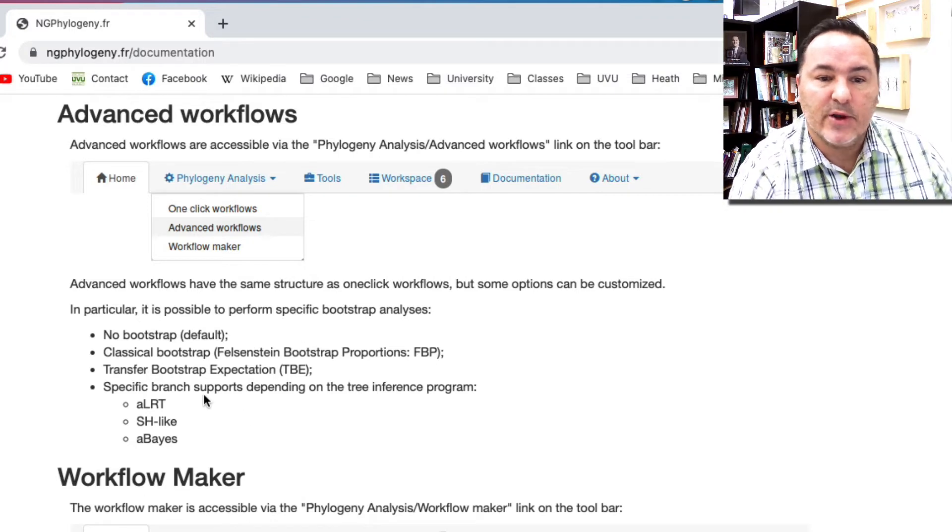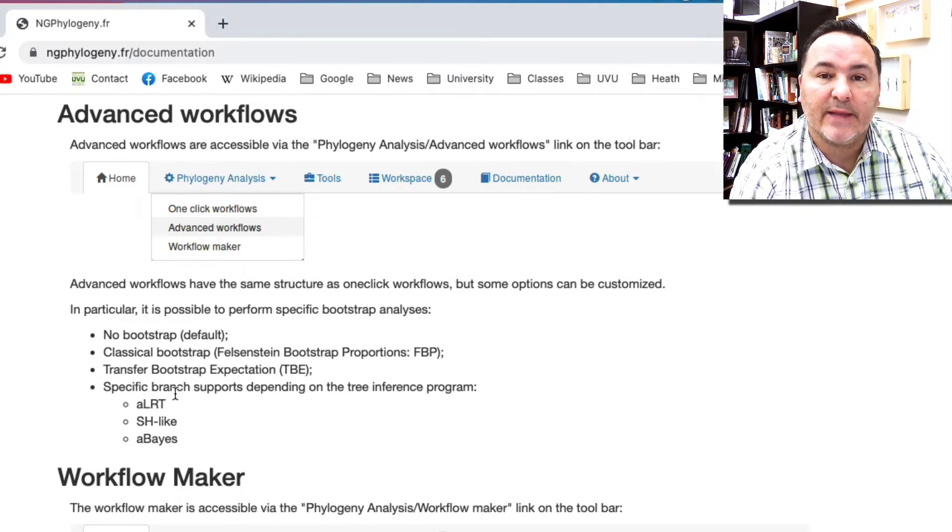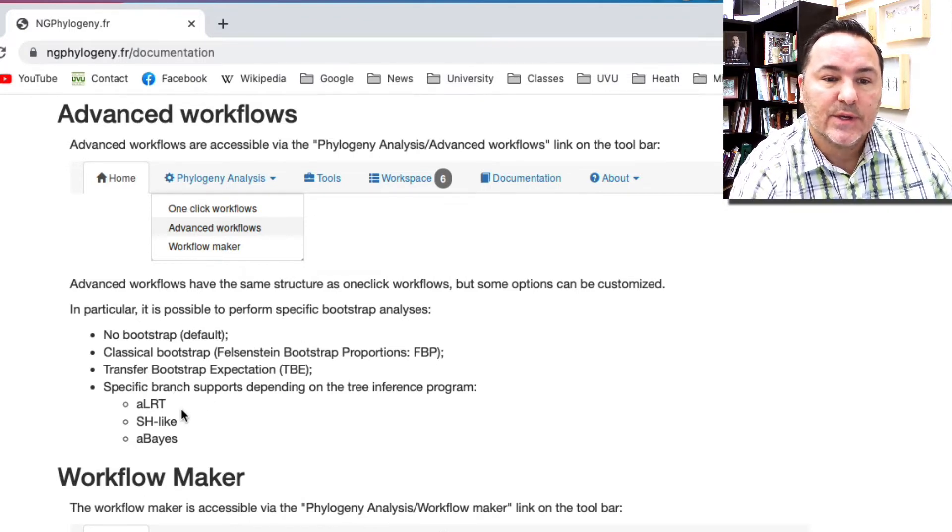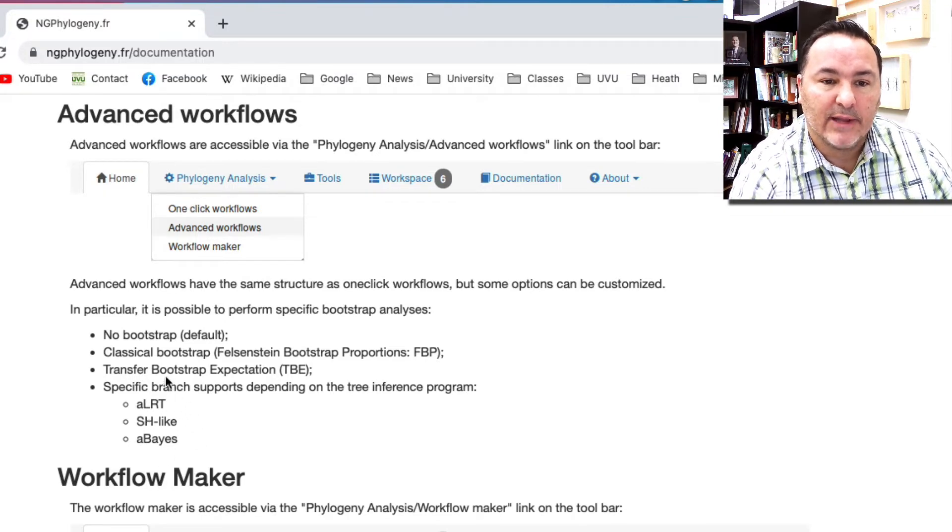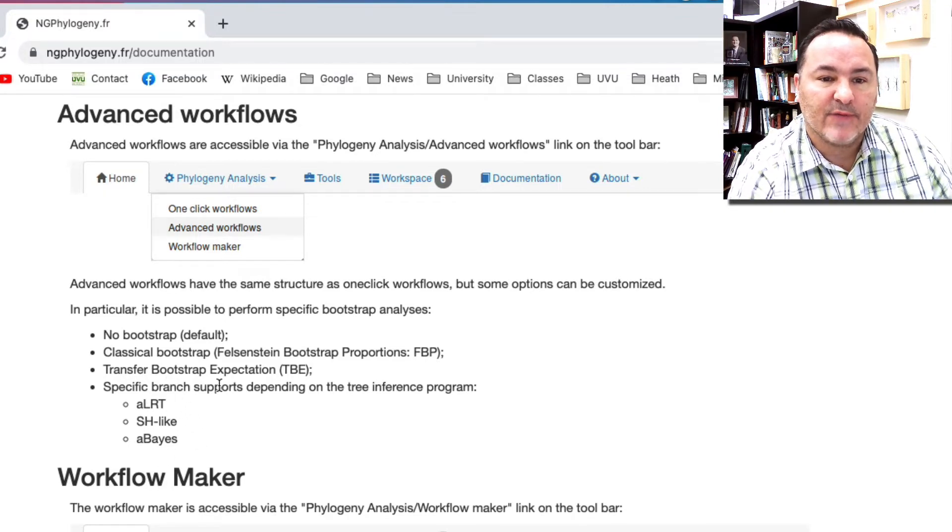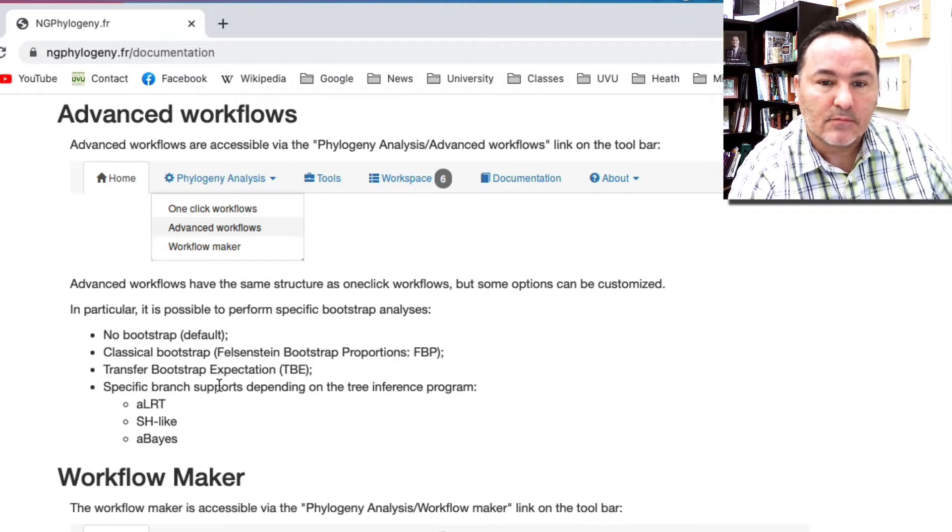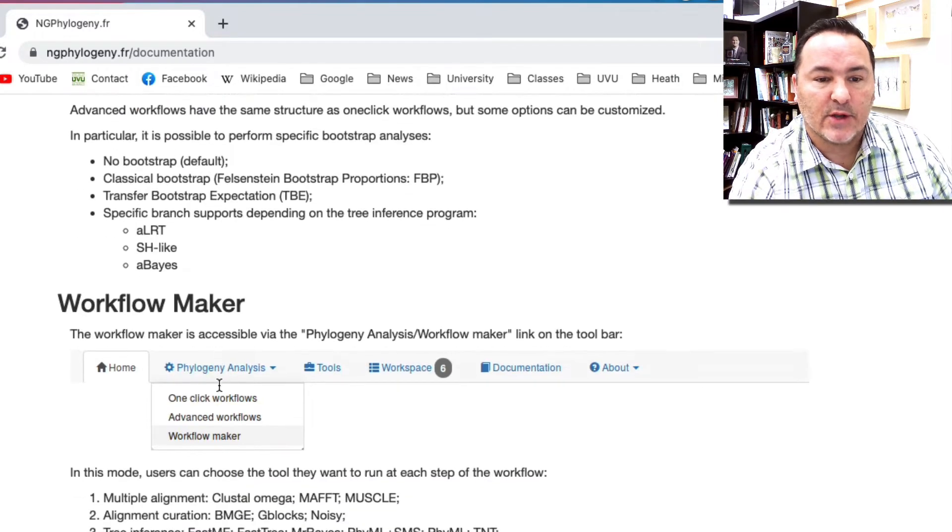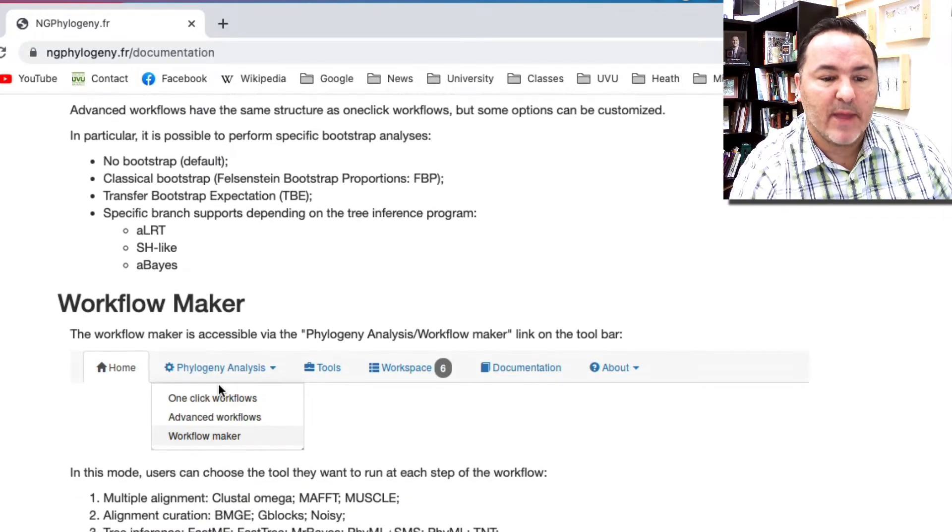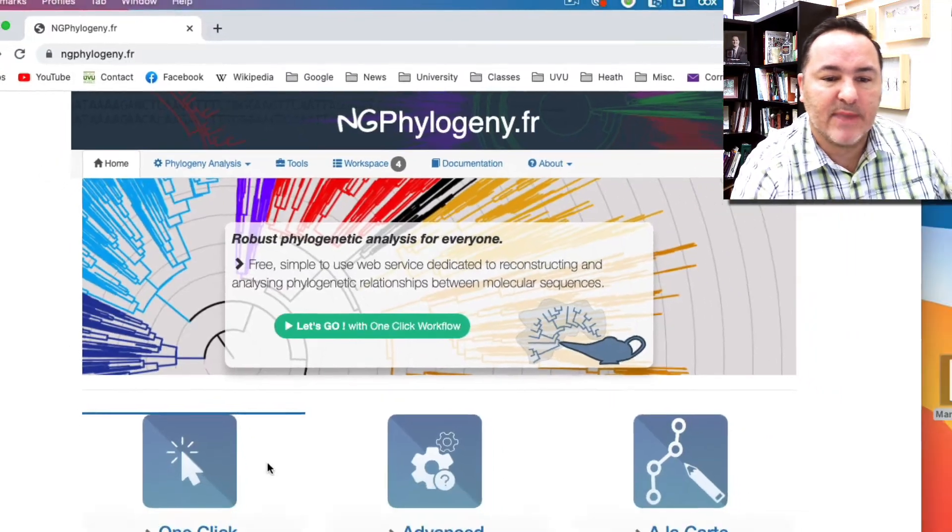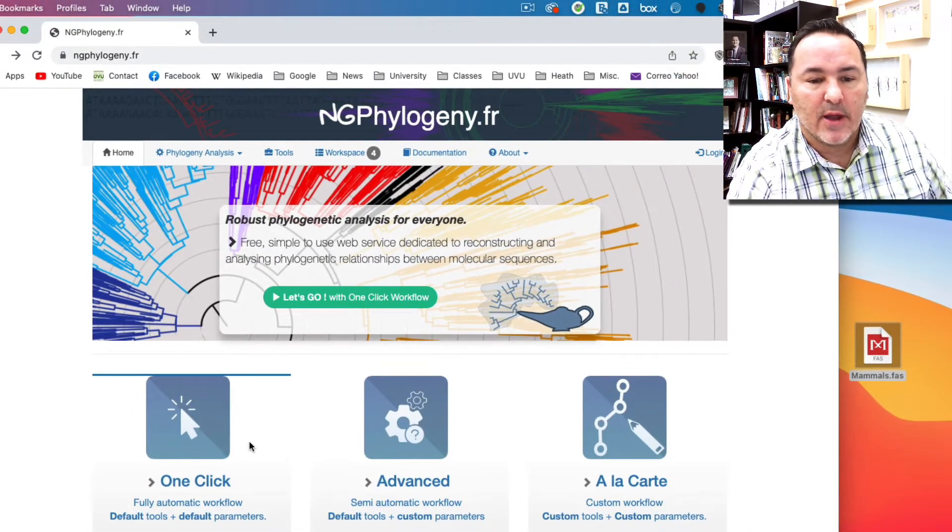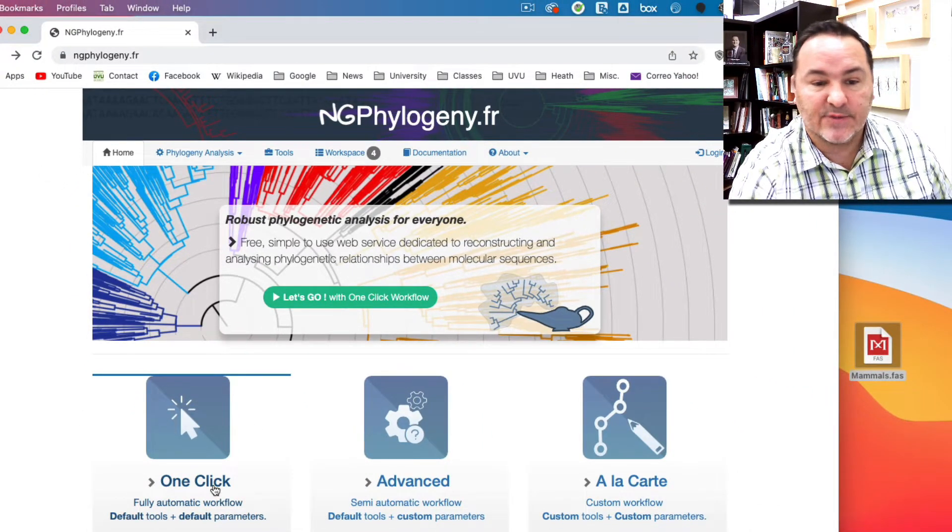This is also where you could make sure and ensure that you're getting branch support values calculated if that's what you want to have. You can also use the workflow maker to make any of the workflows that you want. Let's go back to this main page and show you how to do this.